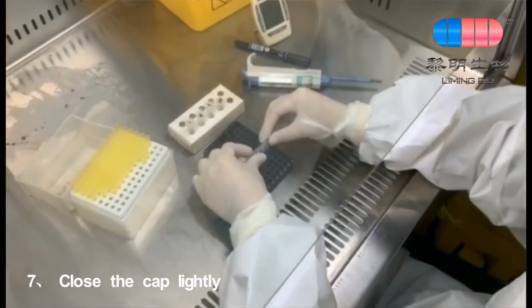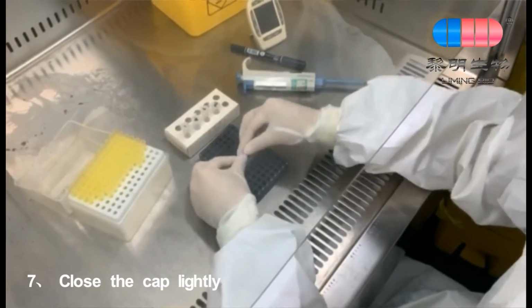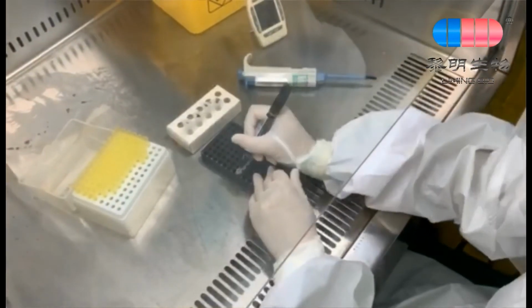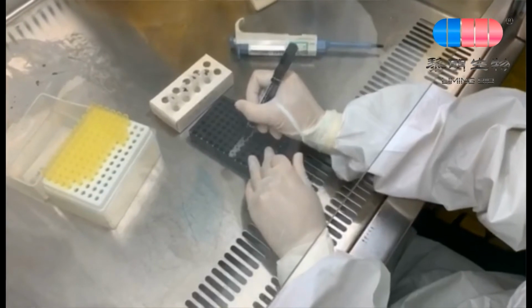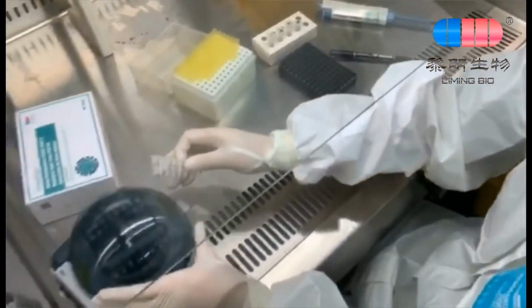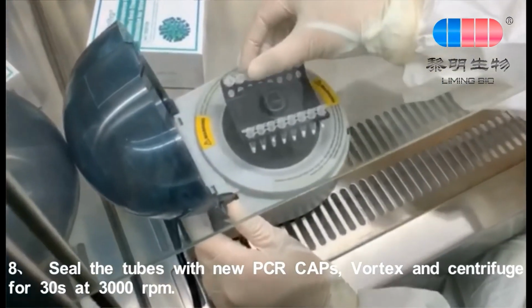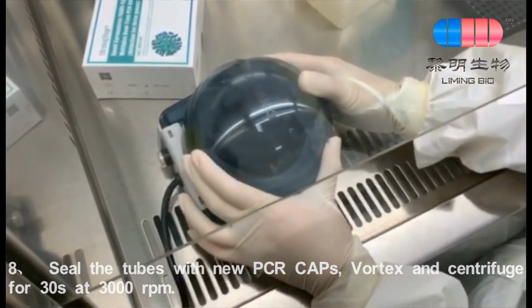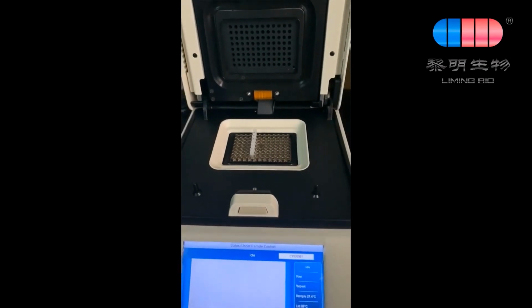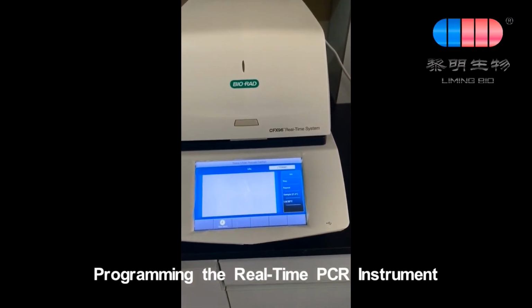Close the cap lightly. Seal the tubes with new PCR caps, vortex, and centrifuge for 30 seconds at 3000 revolutions per minute. Programming the real-time PCR instrument.